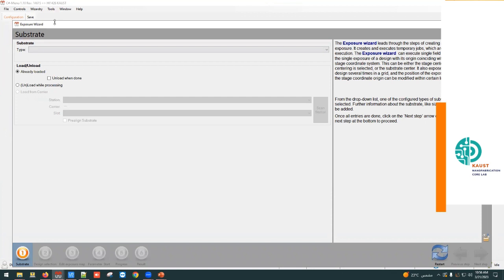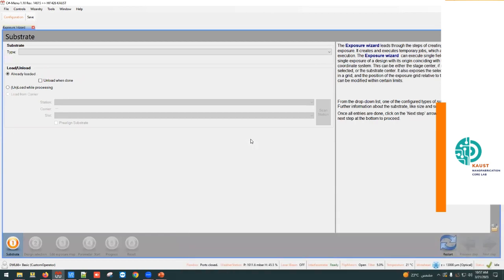That's it, and it will open, okay? This window is floating now, but when I move it, can you see this thing in the middle that appears? So if I release it when the arrow is in the middle one, it is placed in here like a standard window, like a fixed window in here.